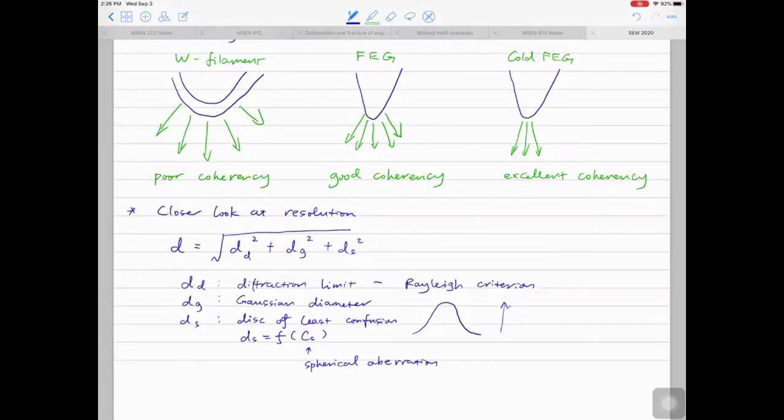The purpose of writing this down is not to ask you to memorize what's going on, but I want to convey the information. When you can calculate the resolution limit, it's the upper boundary you can achieve. You cannot go over that. You're always within that. But in real life, it's never that simple. You do the best to achieve the diffraction limit, then you can get the resolution.